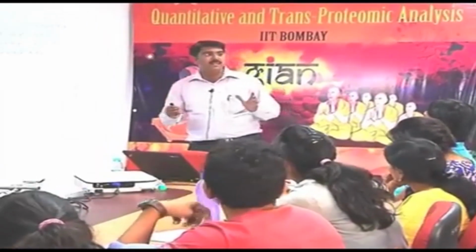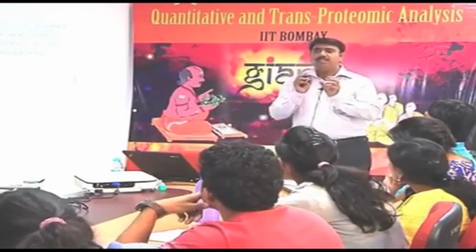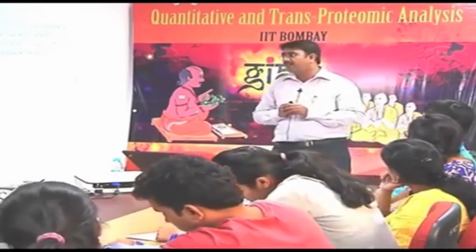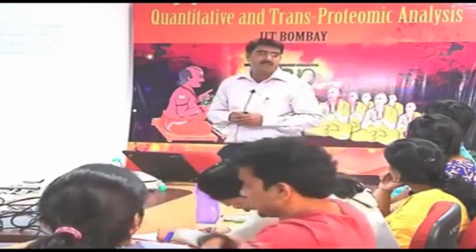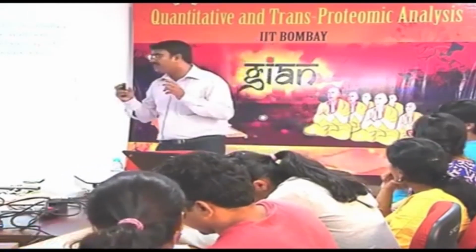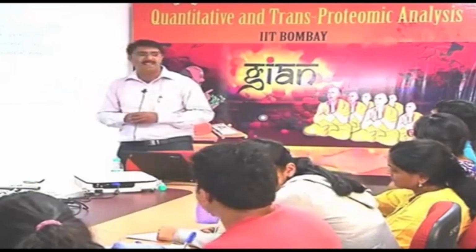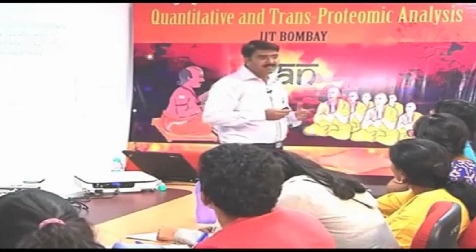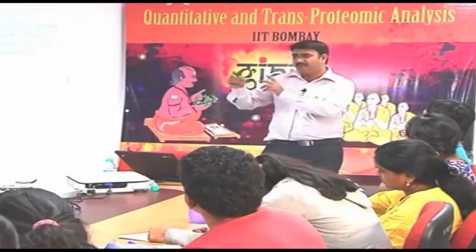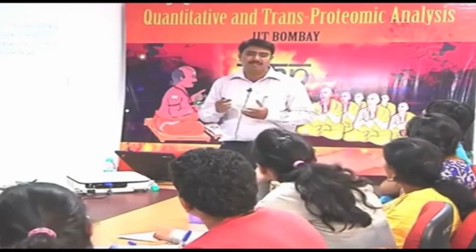Here, label free detection comes with a different concept: solution interface and solution solid interface. These are the two techniques. You have heard about ITC, isothermal titration calorimetry. If two proteins are interacting together, what energy is absorbed or released into the reaction system? We call this a solution interface. I think there is also a technology called NanoTemper, which is once again a solution based, solution interface.